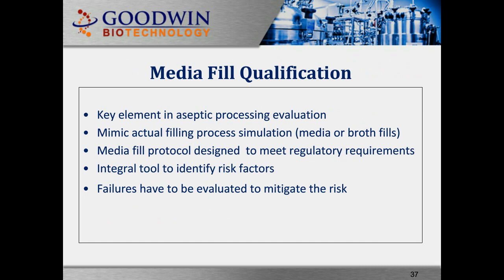Media fill. What is media fill? Media fill is the performance of an aseptic manufacturing procedure using a sterile microbiological growth medium in place of the drug solution to test, qualify, or confirm whether the aseptic procedures are adequate to prevent contamination during actual drug production. A key element in aseptic processing evaluation is to mimic the actual filling process using media or broth fills. The media fill protocol should be designed to meet regulatory requirements, and is an integral tool to identify risk factors, and failures have to be evaluated to mitigate the risk.